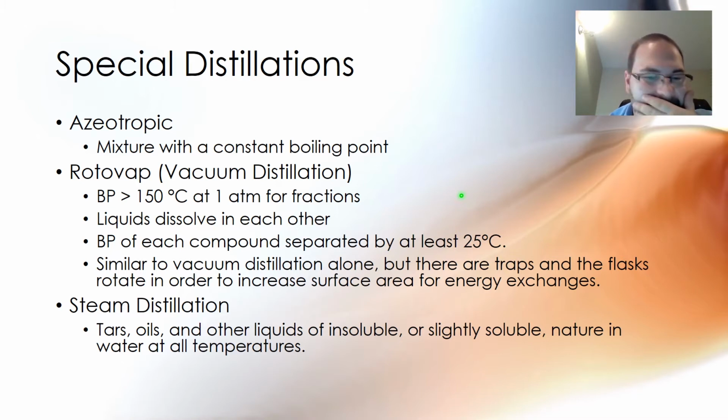It's really quite something. And then over time, all of that travels up into the column, and this column is usually made of a really high grade pressurizable glass, very thick walled, and a lot of the newer ones have a coil of glass tubing that goes inside the collection column, and it will have a cooler attached to it with hoses.